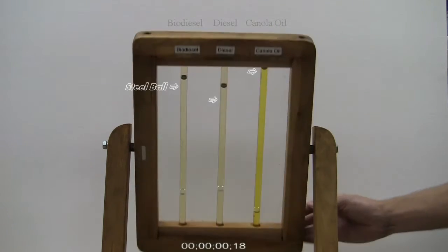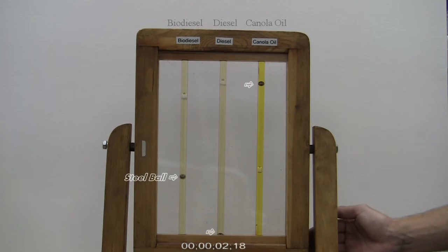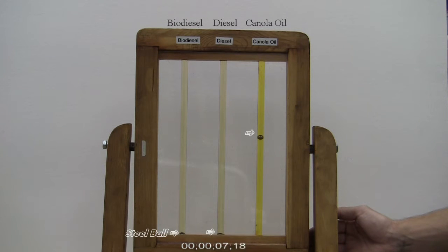Biodiesel typically has a slightly higher kinematic viscosity when compared with petroleum diesel, around 4.5 centiStokes for biodiesel and 3 centiStokes for number 2 diesel.